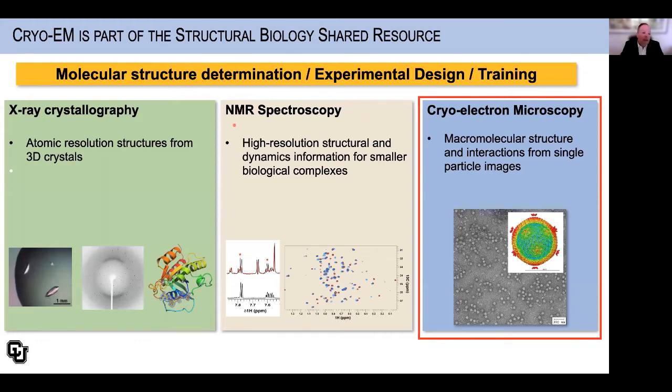The CryoEM facility last year became part of one of the shared resources from the University of Colorado Cancer Center. So we joined X-ray crystallography and NMR spectroscopy to provide a really comprehensive set of tools for macromolecular structure analysis on the School of Medicine's campus.